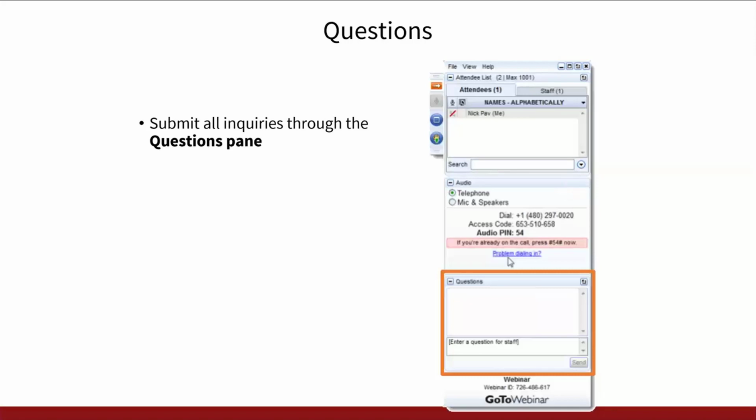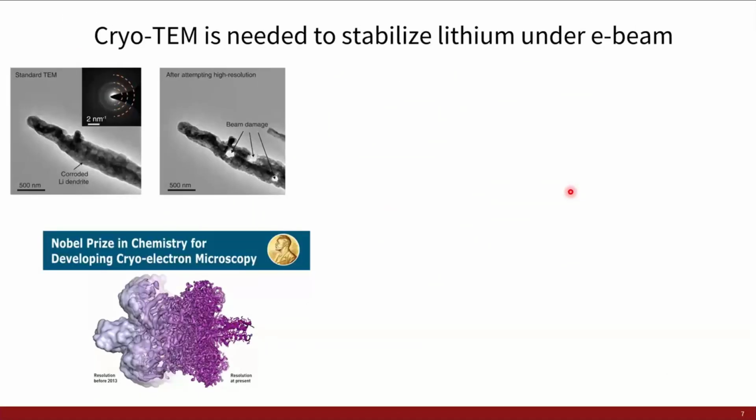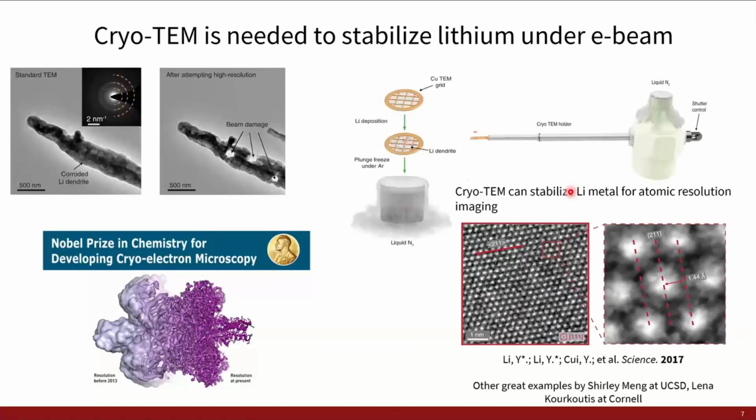Okay, yeah, that's a great question. So let's see if I can go back to that slide. The cryo holder we use is a Gatan product, a Gatan 626. But the main advantage of a cryo holder is, firstly, with a vacuum transfer holder, assuming that it does maintain your sample at good vacuum, which is not necessarily a given, you don't truly know the vacuum that your sample is seeing and whether that's good enough to prevent oxidation.